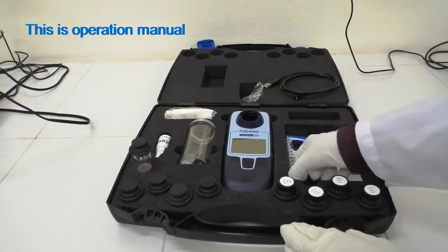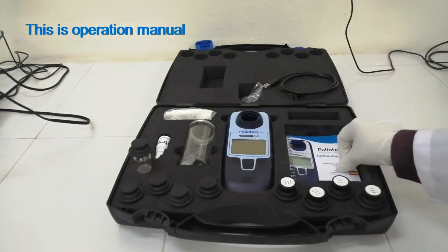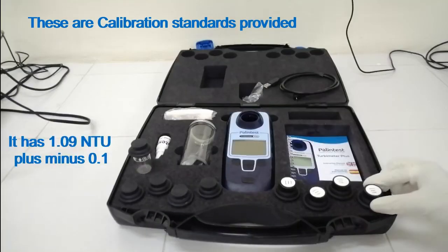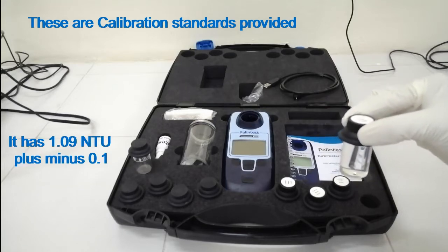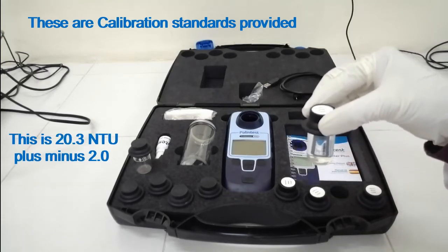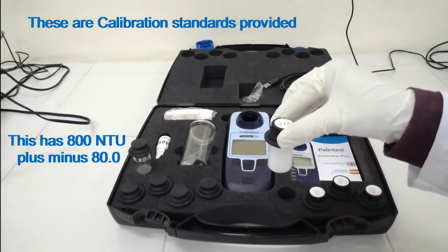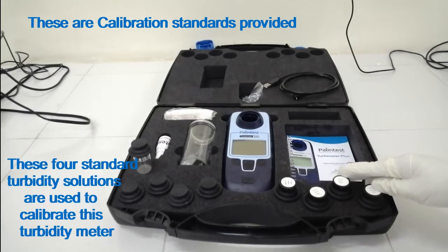This is the operation manual. These are the calibration standards provided: 1.09 NTU ±0.1 NTU, 20.3 NTU ±2 NTU, 105 NTU ±10 NTU, and 800 NTU ±80 NTU. These four standard turbidity solutions are used to calibrate this turbidity meter.